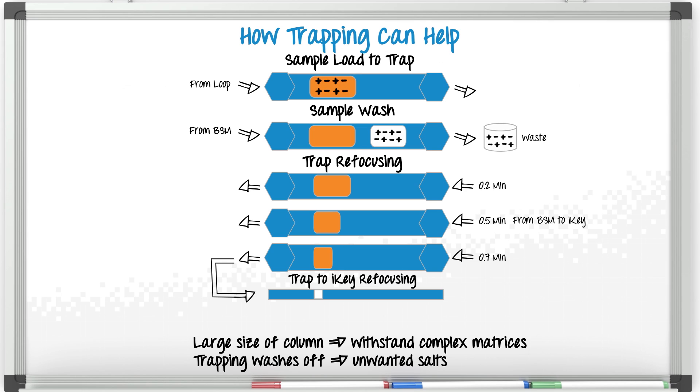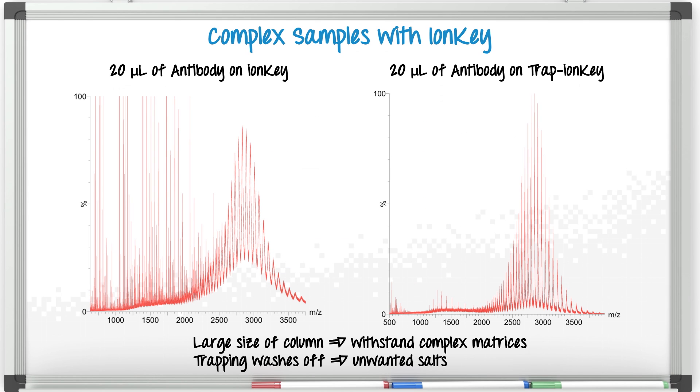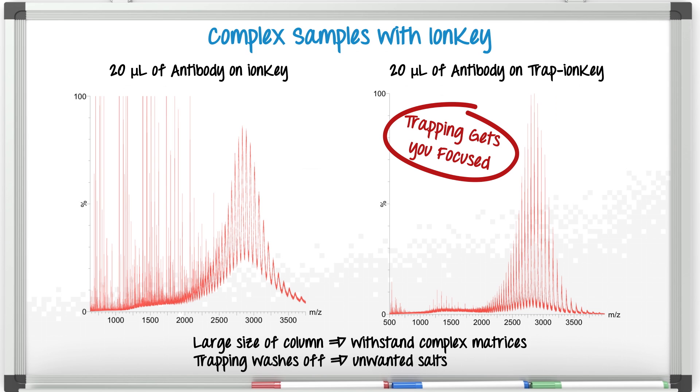Here's an example of a real complex sample. We were looking at an intact monoclonal antibody. We needed to see very low levels of the antibody for this project. Just look at what trapping was able to do. Without trapping, injecting 20 microliters really delivers poor results with bad chromatographic peak shapes and overly complex mass spectra. With trapping, well you can just see the difference. So trapping seems like a really nice complement to microflow — you don't have to feel trapped. Trapping can help you get focused.